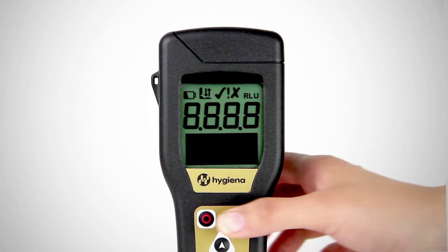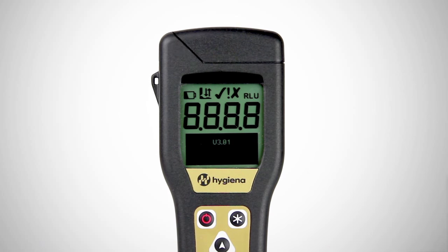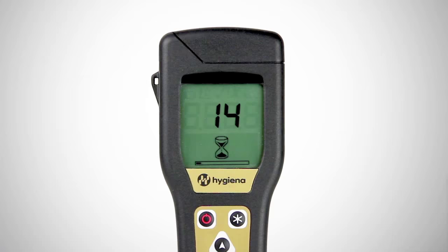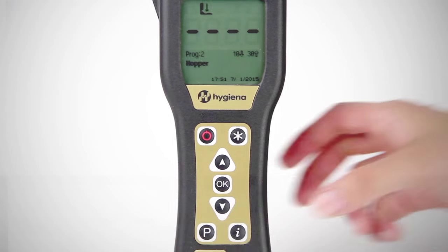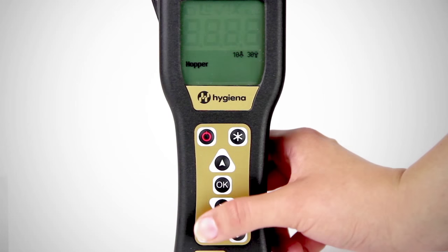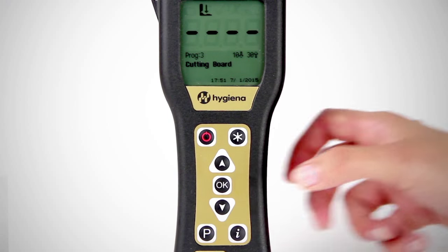Turn on the luminometer before you begin testing to allow time for the system's calibration self-check to run. If you've already programmed test locations into your luminometer with SureTrend software, select a location to be tested.